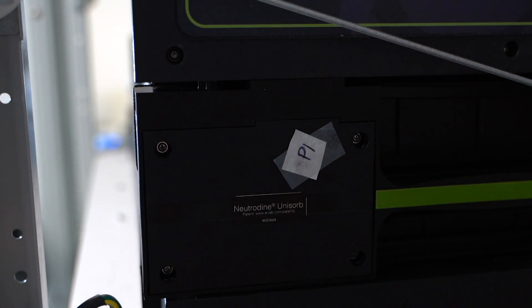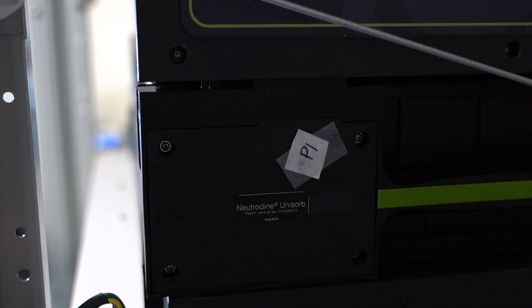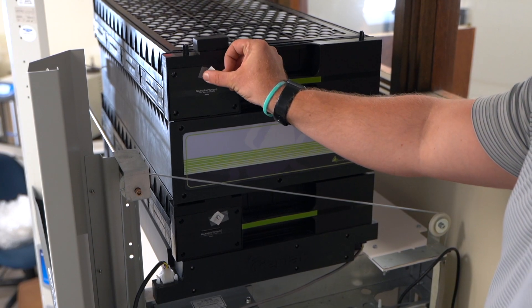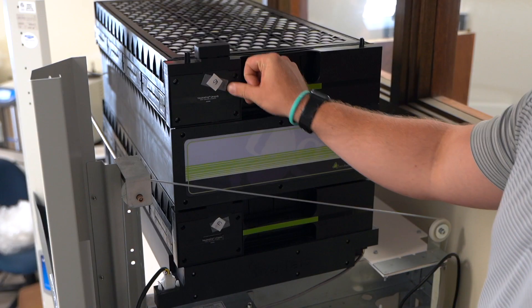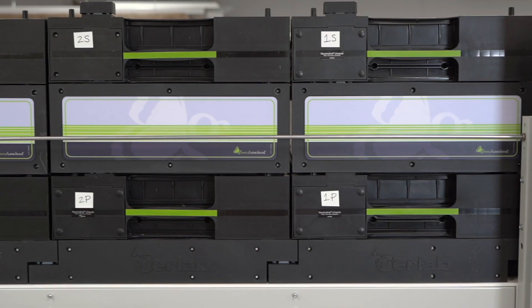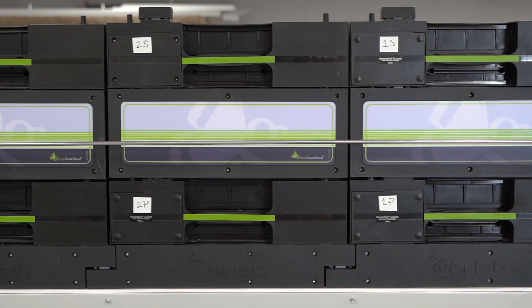The first filters to be installed are the primary filters, and they will be labeled with a P. The second row of filters are the secondary filters, and they will be labeled with an S. The filters then need to be numbered, starting with 1 on the side closest to the command module.